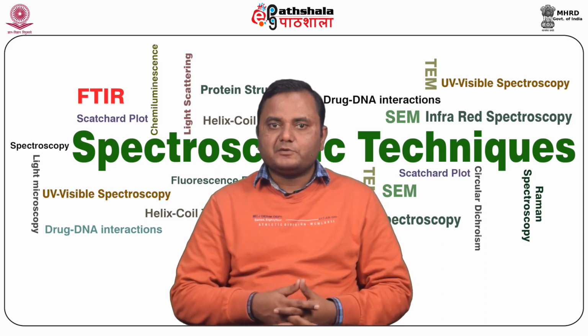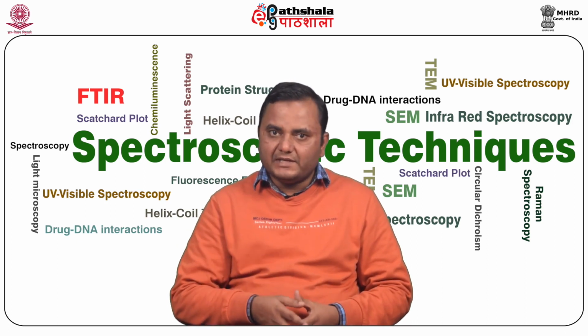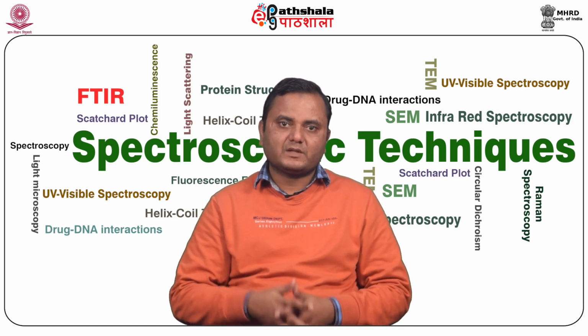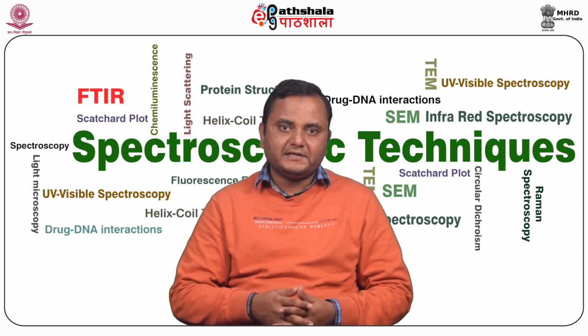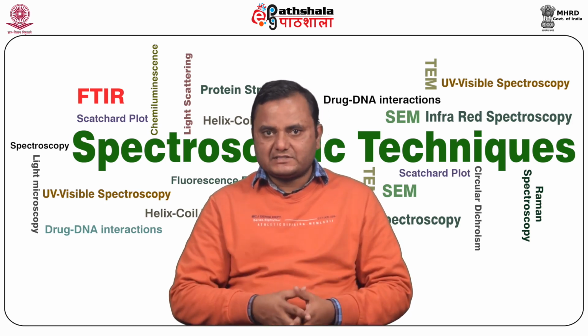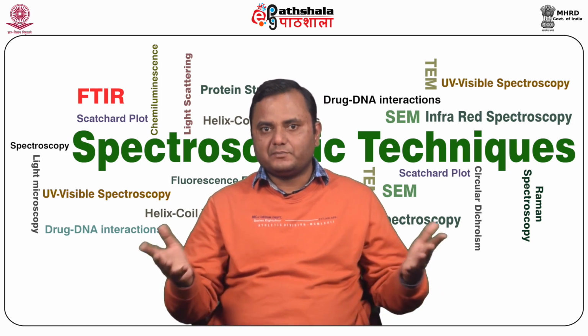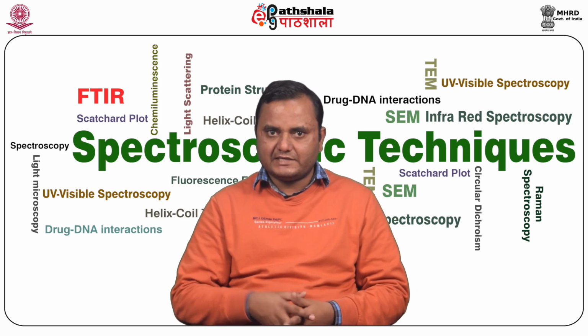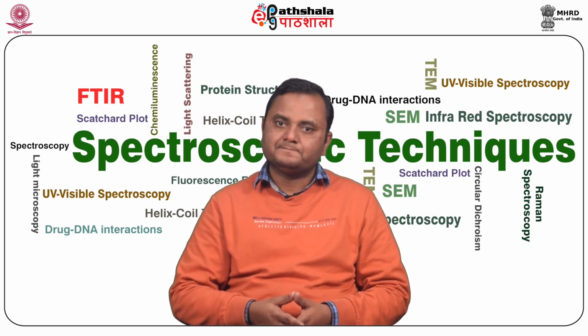In flow cytometry, it is used for the labeling of antibodies, lipids, nucleotides, oligo-DNA and oligo-RNA, peptides, and lectins. Based on these fluorescent labels, the mechanisms of several biological processes can be understood by using flow cytometry.